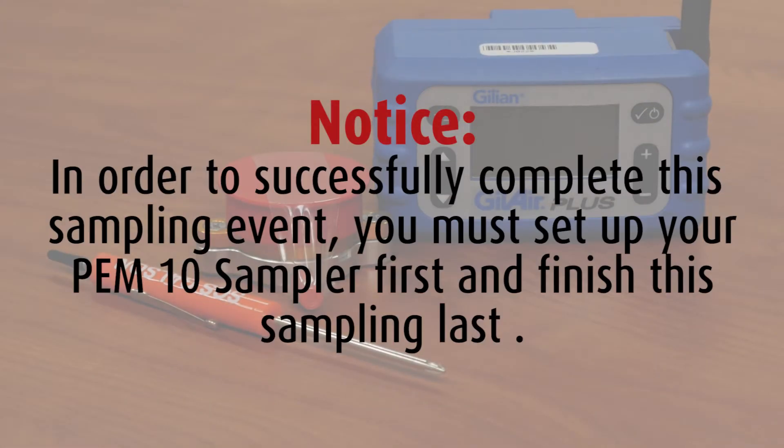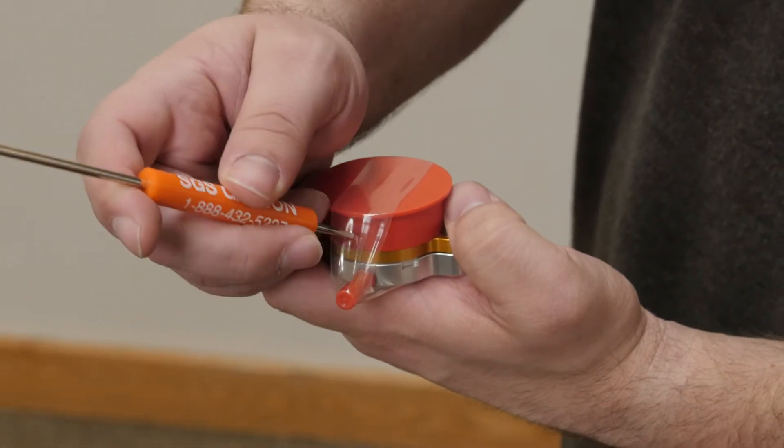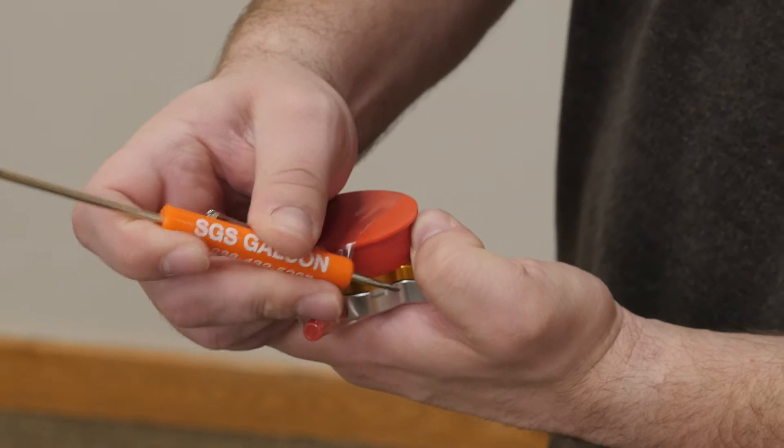Notice: in order to successfully complete this sampling event, you must set up your PEM-10 sampler first and finish this sampling last. Remove the GillAir Plus pump from the case. Remove the PEM sampler from the resealable bag and remove the custody seal along with the red protective caps.